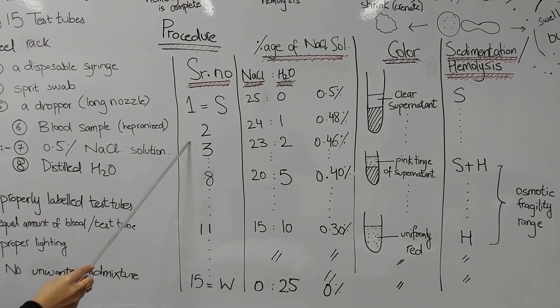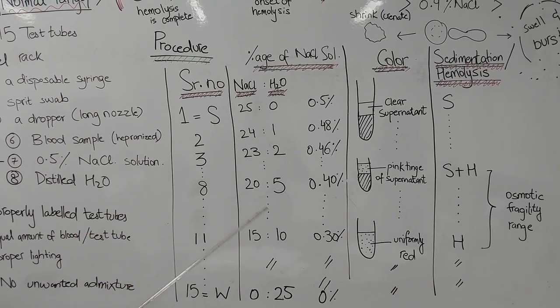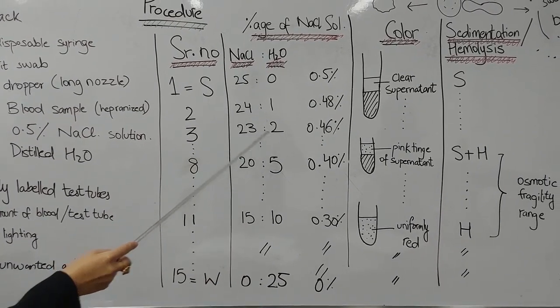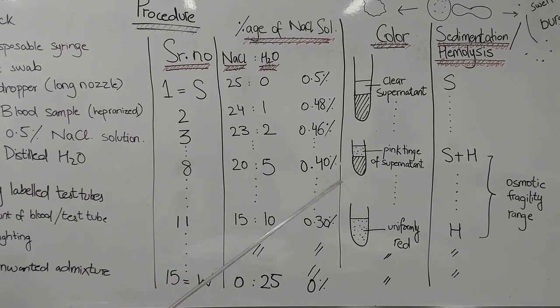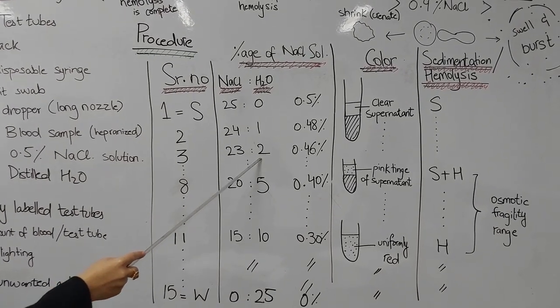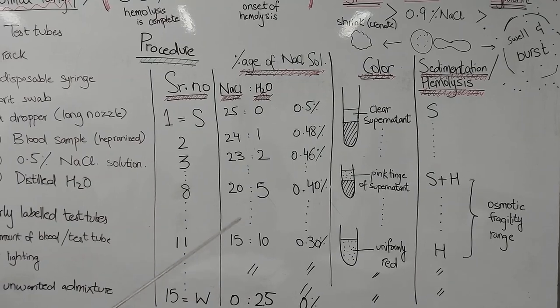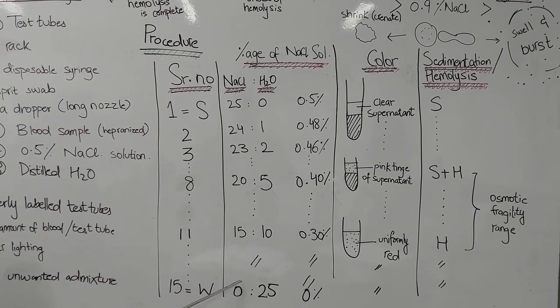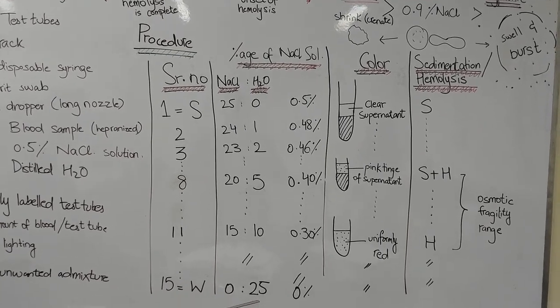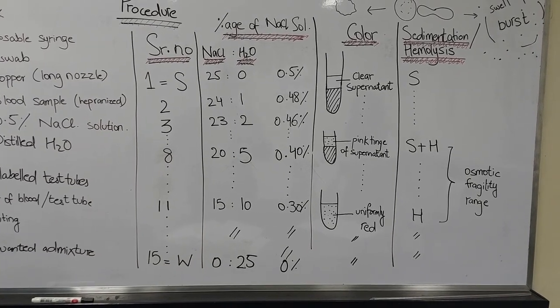In the second test tube I am going to add 24 drops of sodium chloride and one drop of water. Each drop of water dilutes the solution by 0.02%, making this solution 0.48% sodium chloride. In the third test tube, 23 drops of sodium chloride and two drops of water give a concentration of 0.46%. Using the same manner I will prepare the rest of the solutions. For the last, the 15th test tube labelled W, I am going to add 25 drops of distilled water, which has 0% sodium chloride.